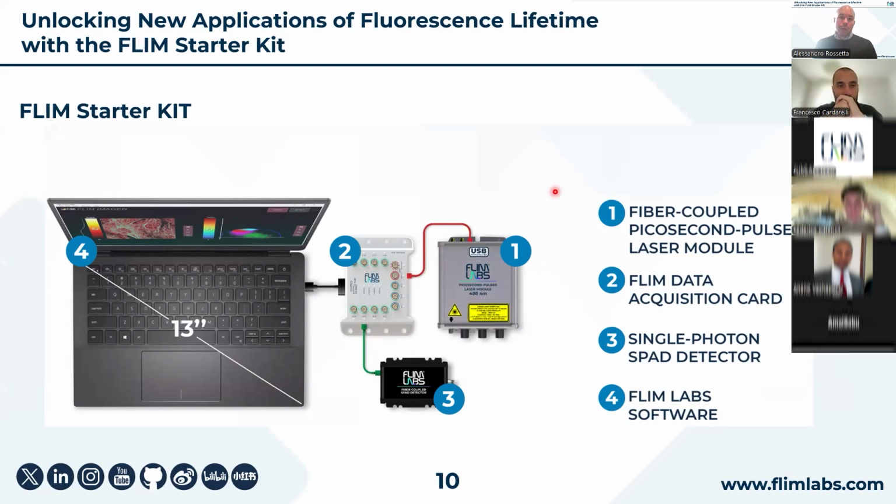which is basically made up of a pulsed laser source that you see here. Then we have the FLIM data acquisition card, our TCSPC acquisition module. Then we have our detector, which is a single photon avalanche diode detector. And of course, we have a software component.